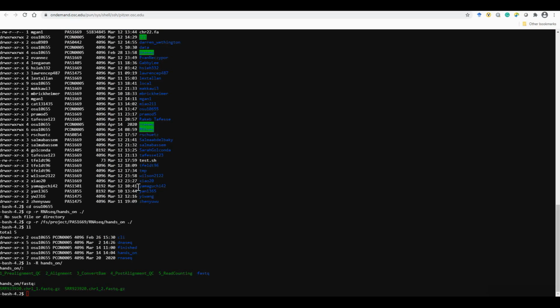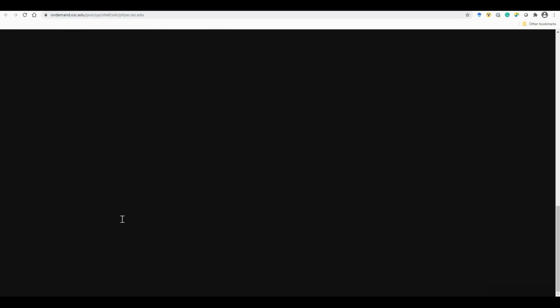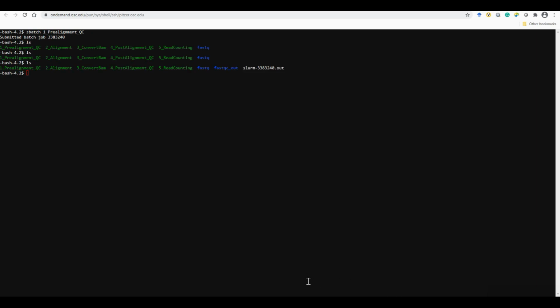So now let's run this script. sbatch. Okay, we have to go to the hands-on folder to run this script. sbatch 1. So now this job is submitted. Okay, now FastQC is done. We can tell the slurm.out file is already out, and the FastQC folder is here.